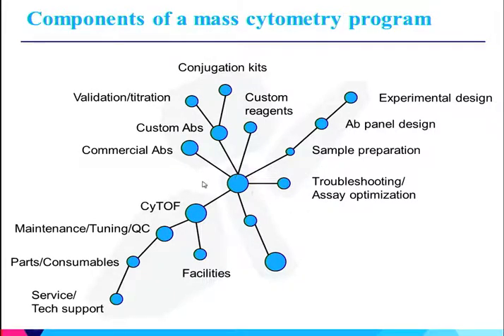So all this goes together to allow you to acquire some data. And an important aspect of CyTOF data acquisition is actually data normalization.